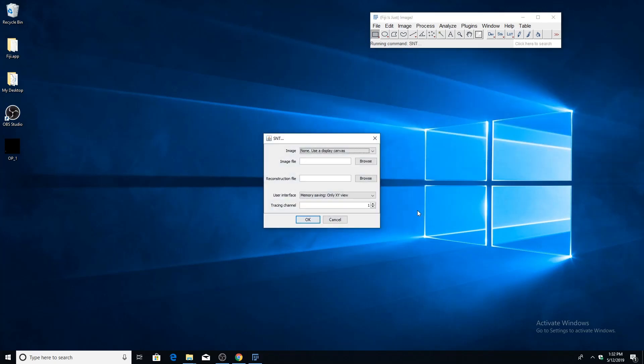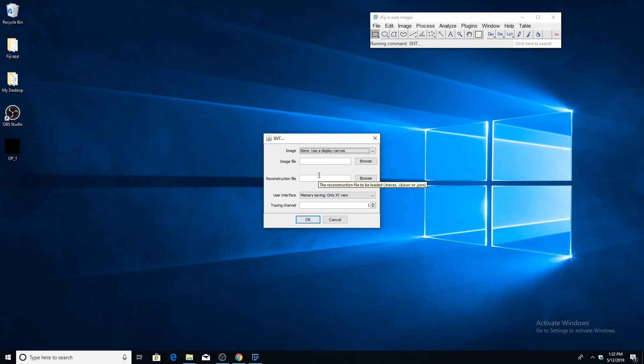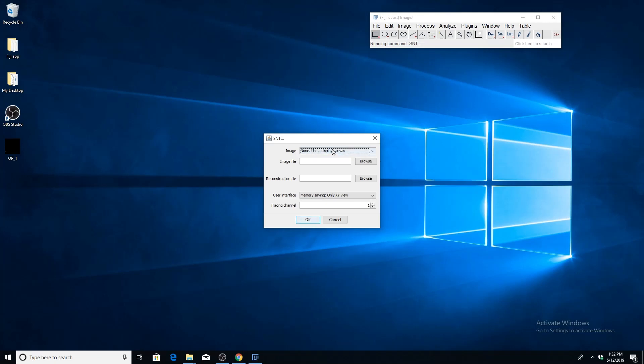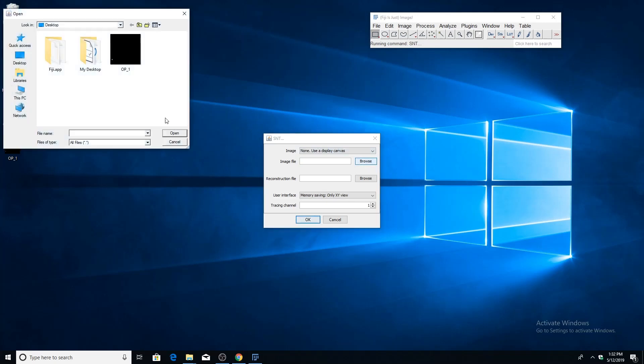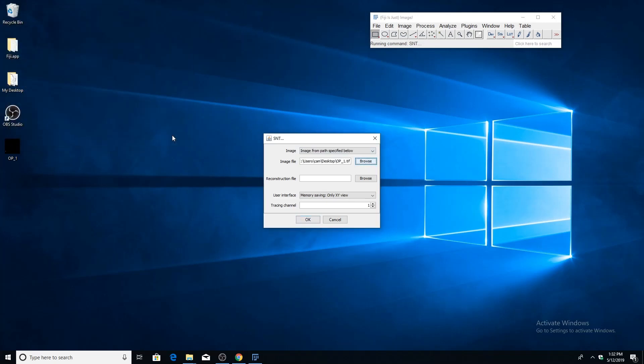A menu will appear which lets you specify some initial parameters. If you hover your cursor over them, a tooltip with additional information will be displayed. The first parameter is the image you want to trace on. If you already had an image open in Fiji, you could choose it in the dropdown menu. But if you want to choose a different image, just go to browse, select the image you want, press open. If you have a reconstruction file you want to import, you could do that here, but we won't be doing that in this tutorial since we're just going to trace one from scratch.